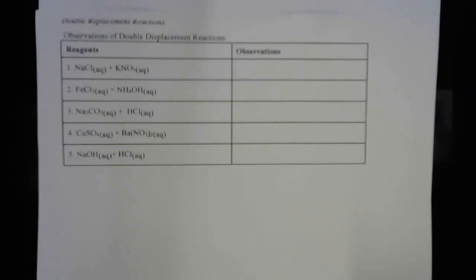Hello and welcome to Sacramento City College Chem 300 Lab in the time of COVID-19. I'm going to be demonstrating two types of chemical reactions for you today.